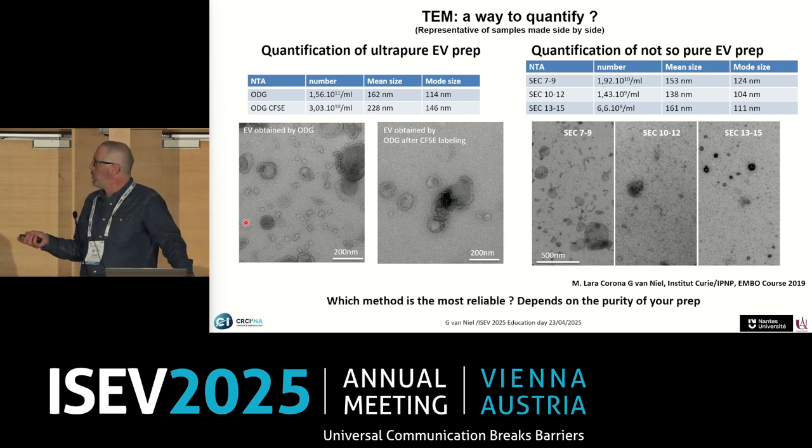So which method is the most reliable? Well, it will first depend on the purity of your prep, and of course, try to combine all kinds of methods to measure the size and the concentration of your samples.